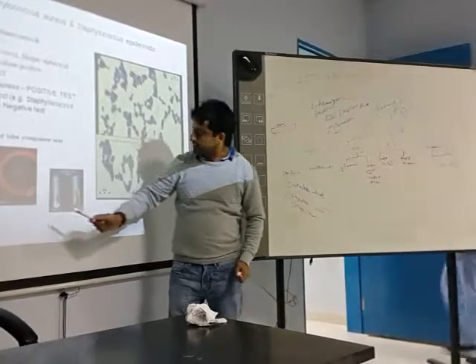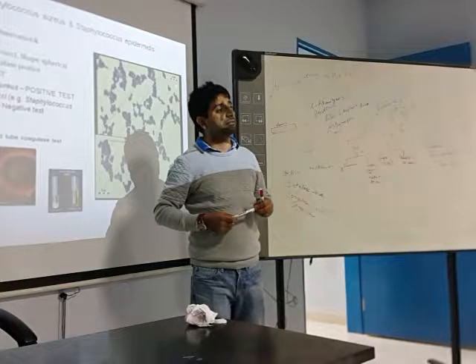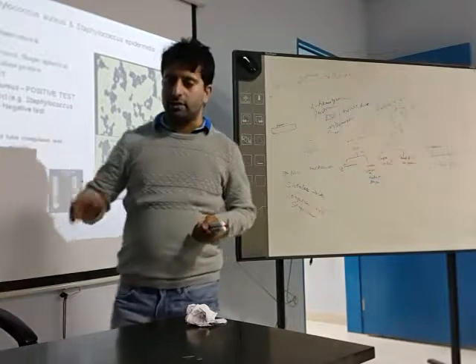This is called a slide test. And in the tube test, this one has a clot and this one has no clot. This is the coagulase test. Fibrinogen is converted to fibrin, and it forms the clot. Fine. Next.